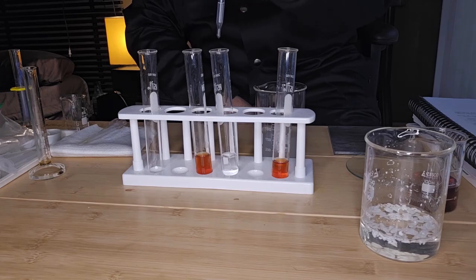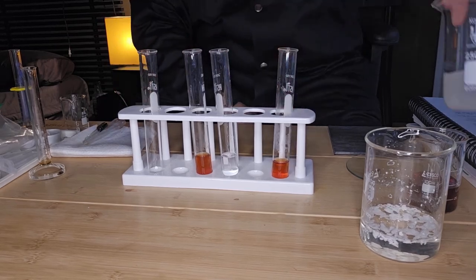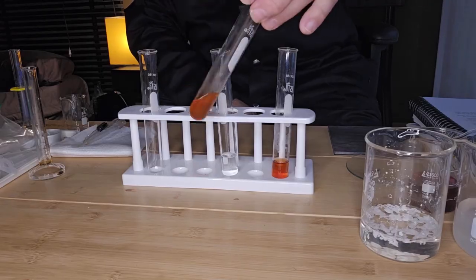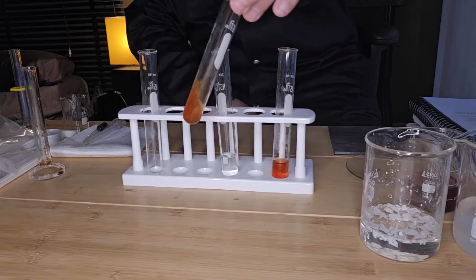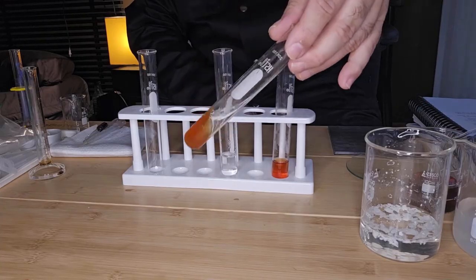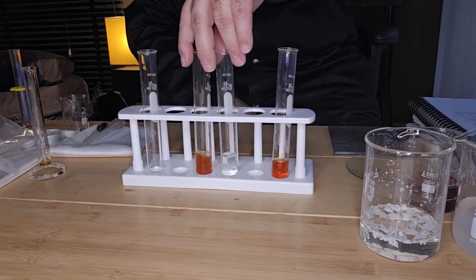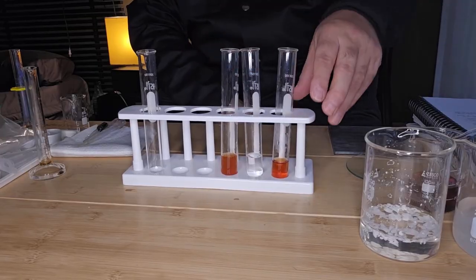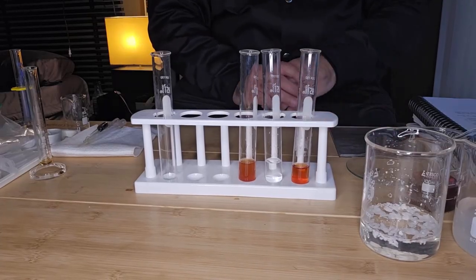Then to the sodium chloride. Okay. That's that added. And the reaction is kind of slow, so we'll come back to it periodically and observe any reaction occurring. So in the meantime, we can move on and make our gel.